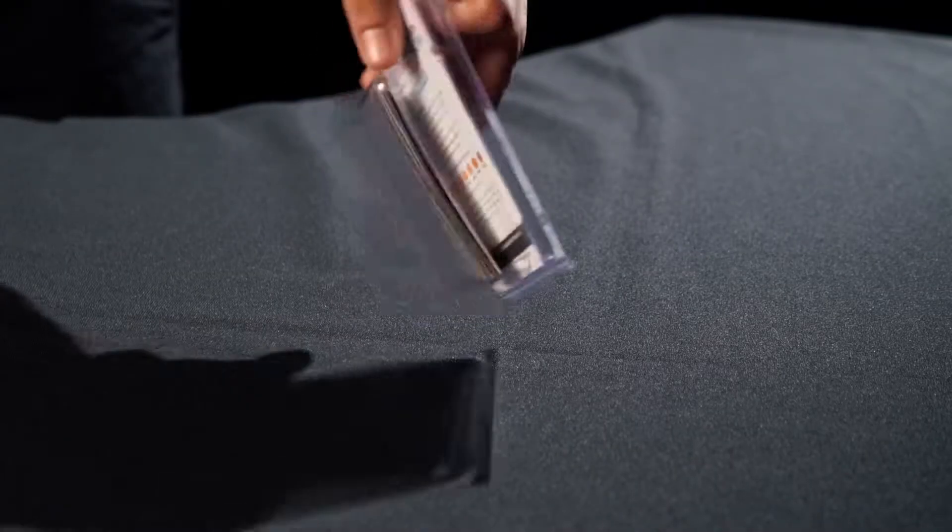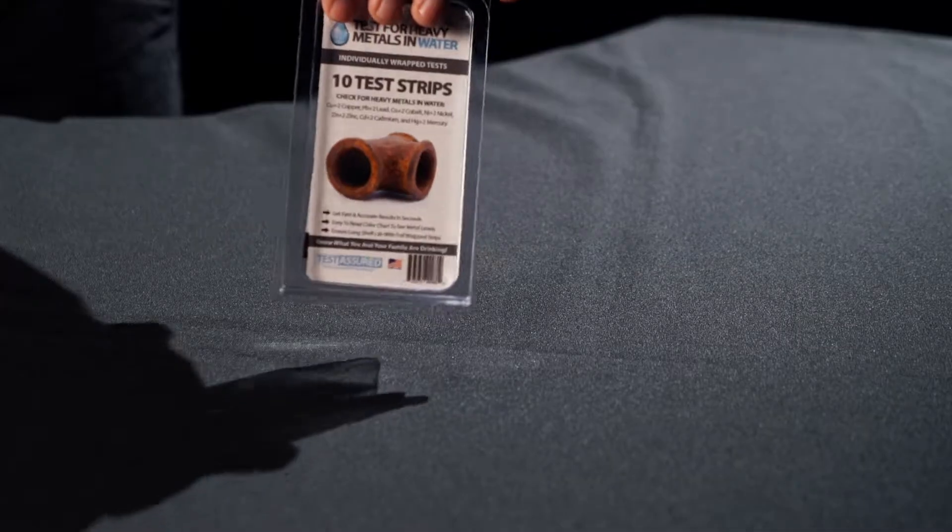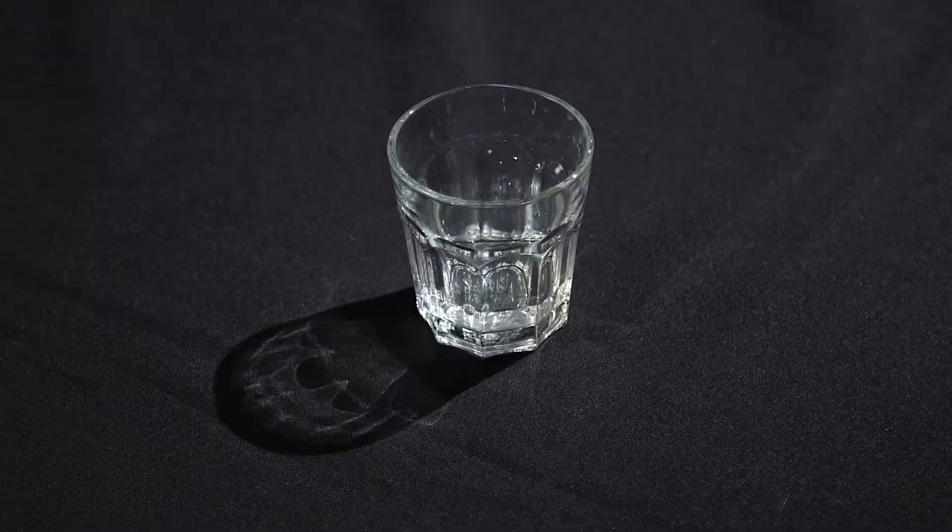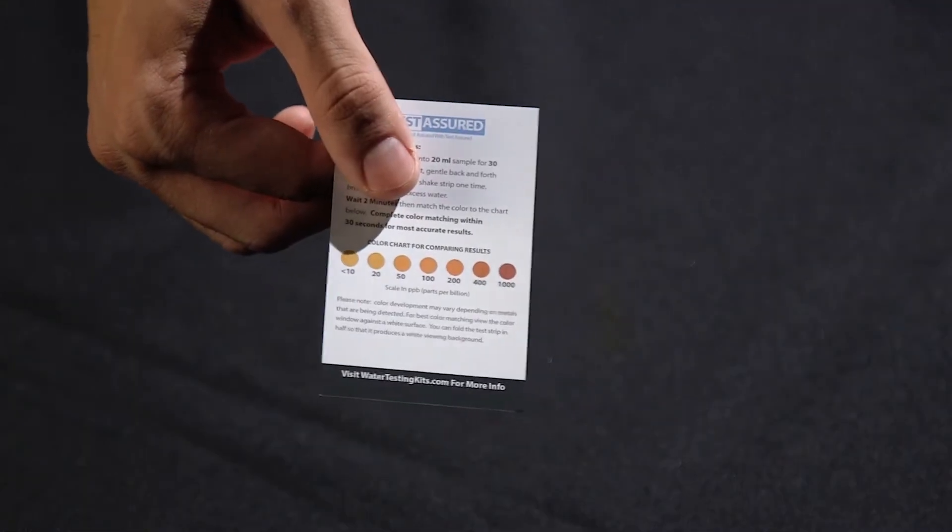For this test, we only need three items from your water test analysis kit: a heavy metals test strip, a water container, and your test color chart for comparing results.